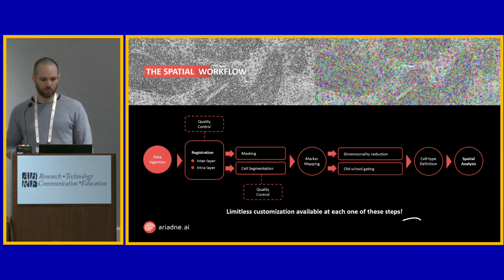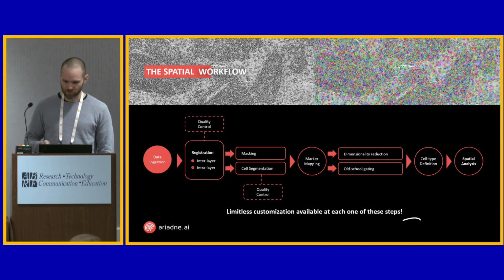Subsequent to that, you can perform dimensionality reduction and gating on the single cell level, define your cell types in this fashion, and perform spatial analysis.